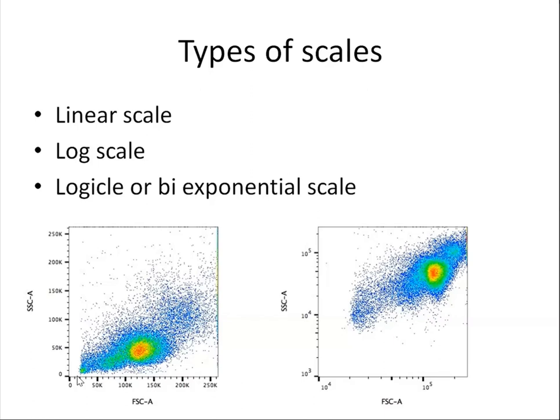Correct. In clinical flow cytometry, what is the smallest cell and the largest cell you analyze? The smallest cell may be a platelet, maybe around 2 to 3 micrometer. And the largest cell you analyze may be around 30 micrometer maximum, or if you want to work with some other thing, maybe 100 micrometer. So the distance here is from 0 to 100.